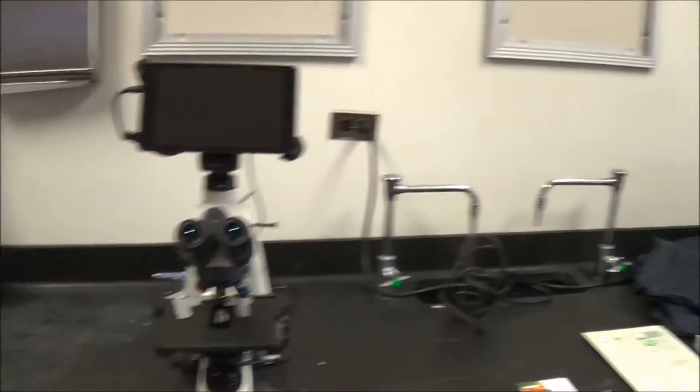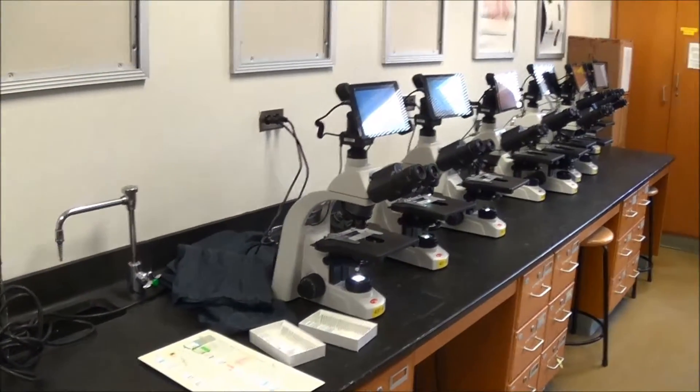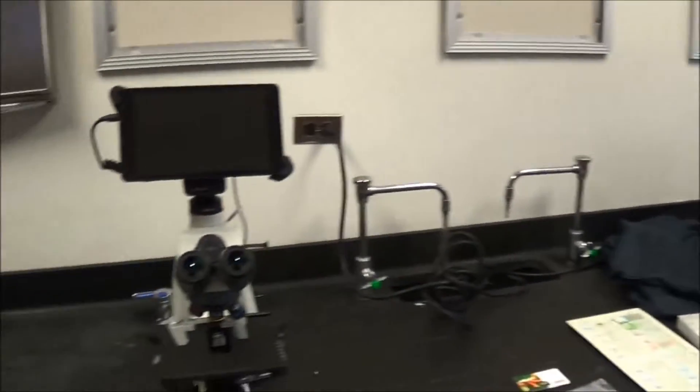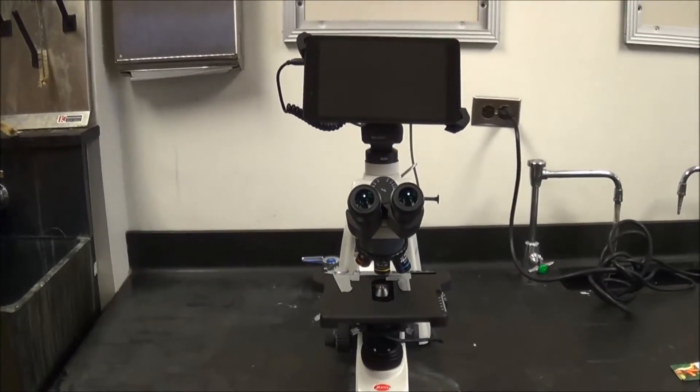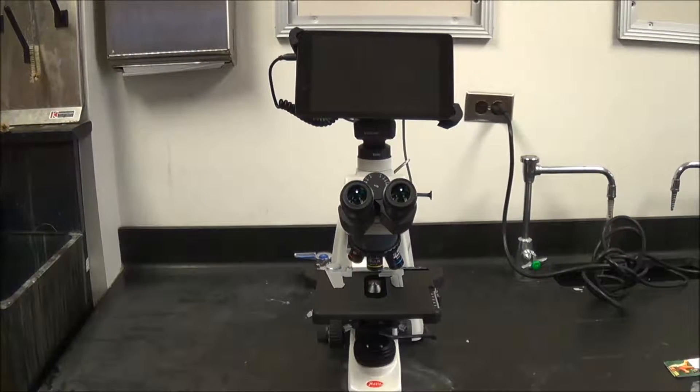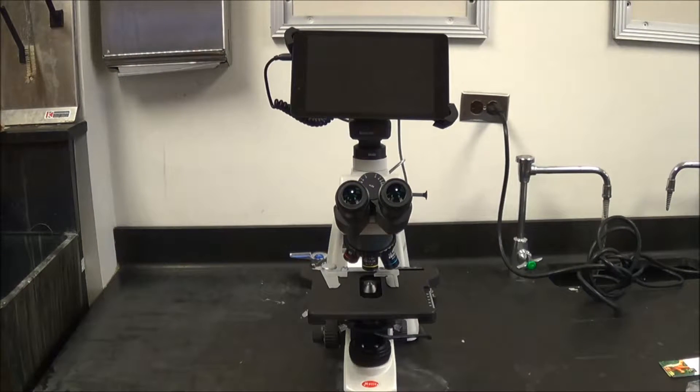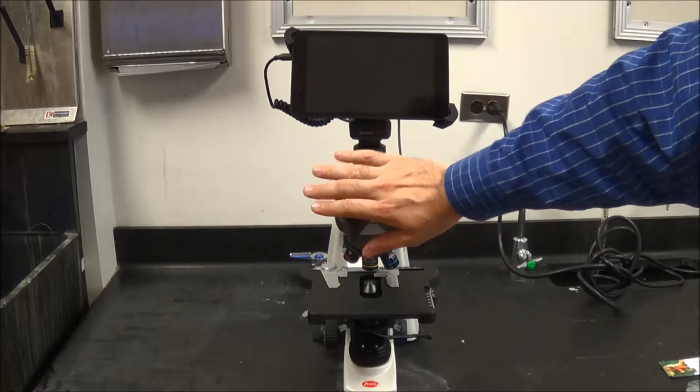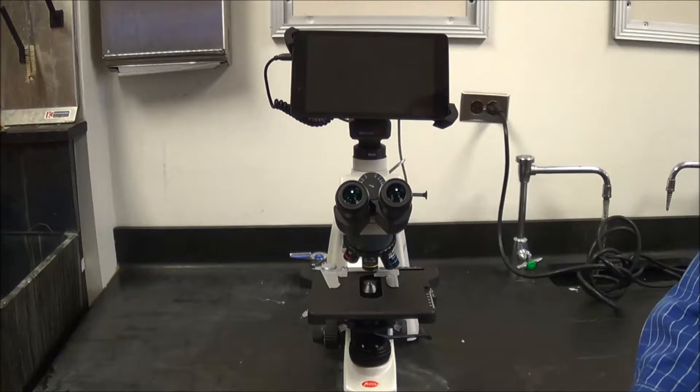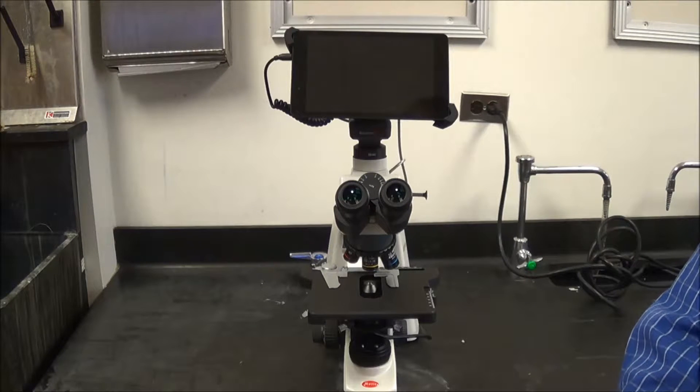For instance, in this class, the microscopes are being kept here along this unused bench. In some of the other classrooms, they're on a different bench. Some of them can actually be kept in some of the cabinets, but the doors are not being closed on the cabinets so that they don't hit the oculars. So wherever the microscopes were initially, please make sure that the students bring them back there.